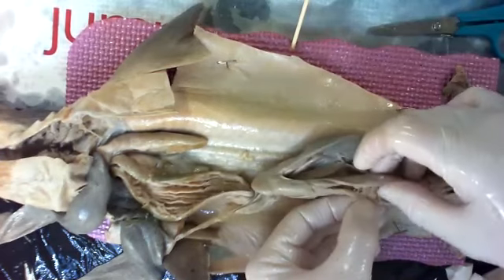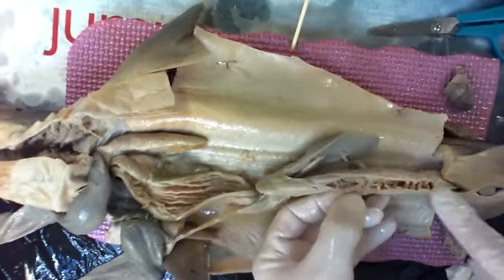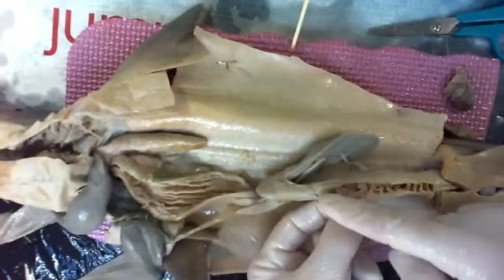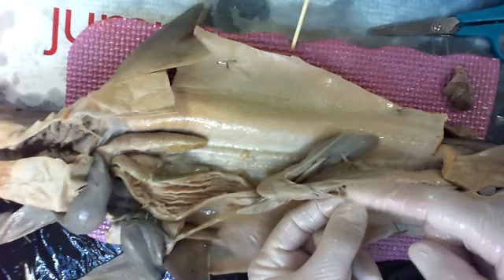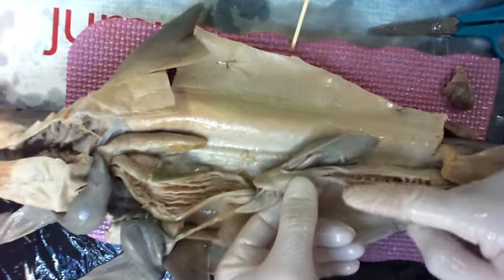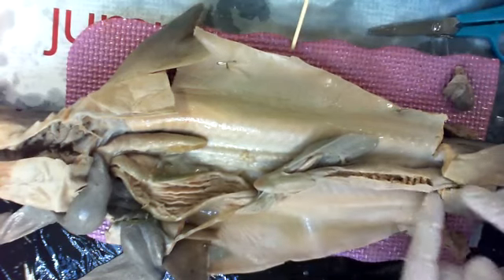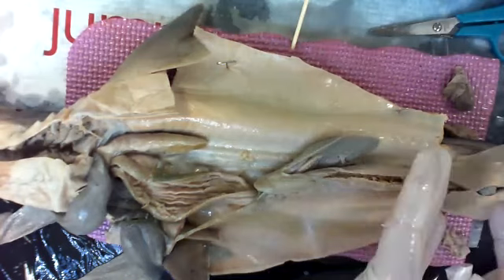It's hard to pull open because it's not really hollow. See that line? It's called spiral intestine because that spiral is like a corkscrew all the way down. So the food has to twist around in a circle as it passes through, getting processed and then pushed out of the body. No large intestine.